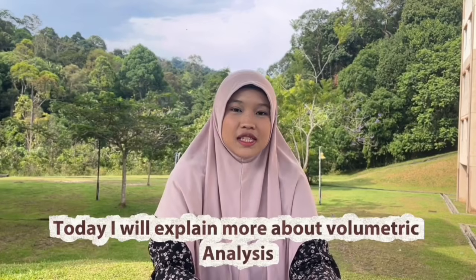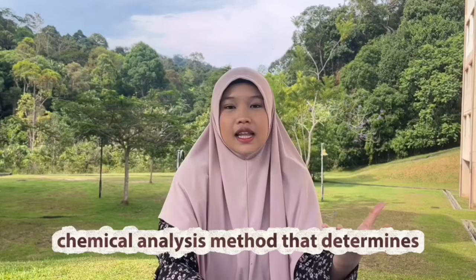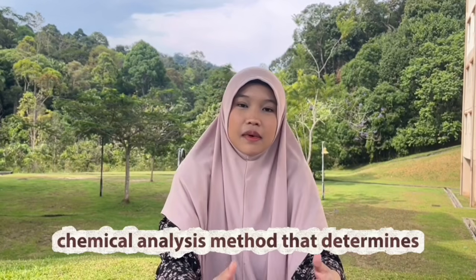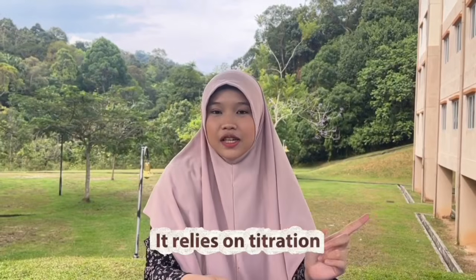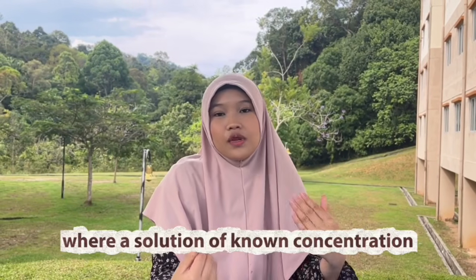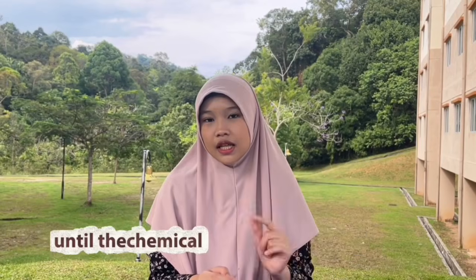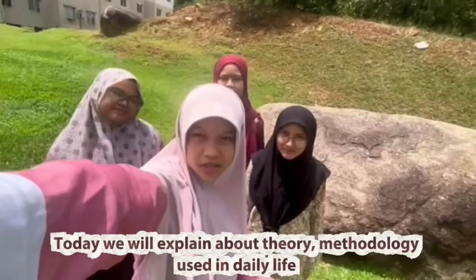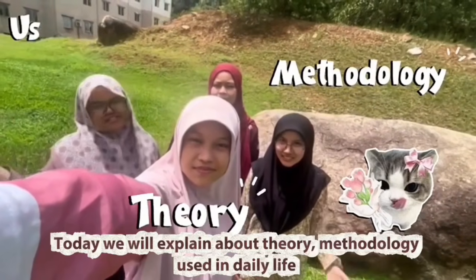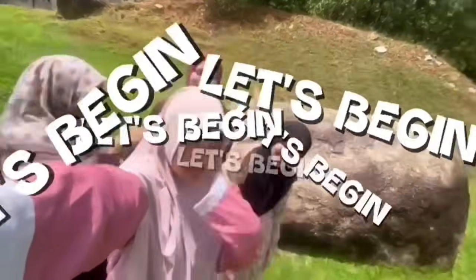Today, I will explain more about volumetric analysis. Volumetric analysis is a quantitative chemical analysis, a method to determine an unknown substance concentration. It relies on titration, where a solution of known concentration is slowly added into an analyte until the chemical reaction fully completes. Today, we will explain about theory, methodology, uses in daily life, and industry in volumetric analysis. Let's go!